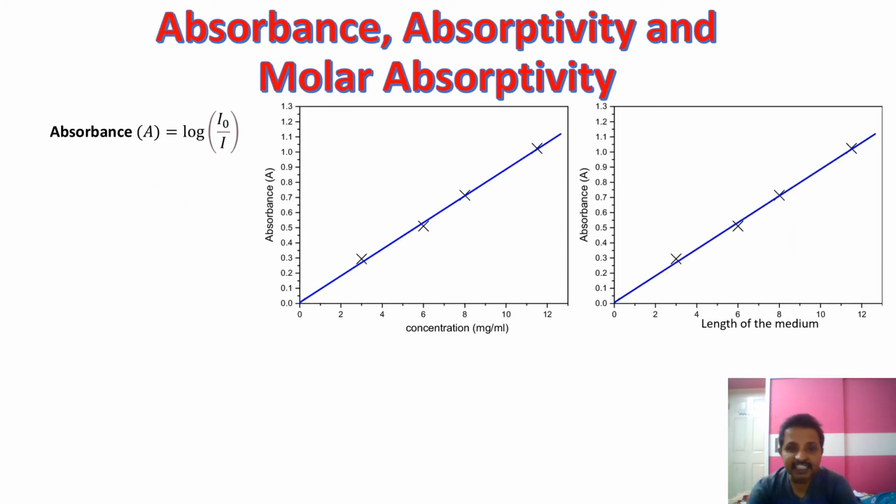Now, let us discuss the relationship between absorbance and concentration of sample and length of the medium.